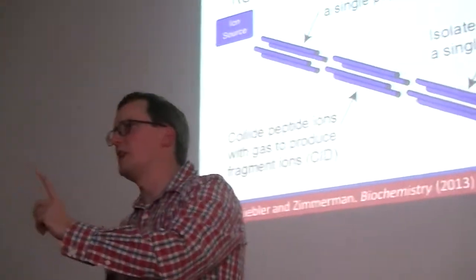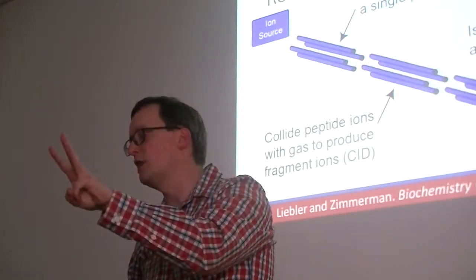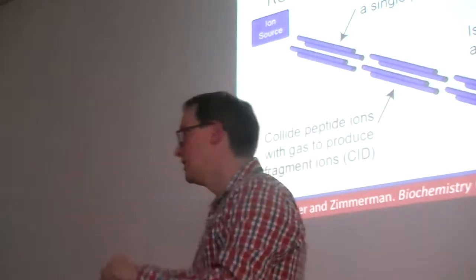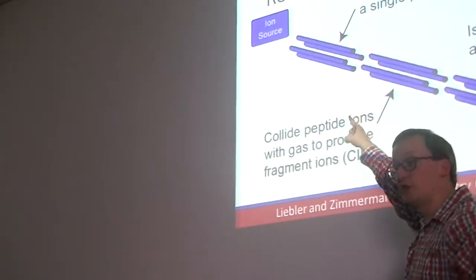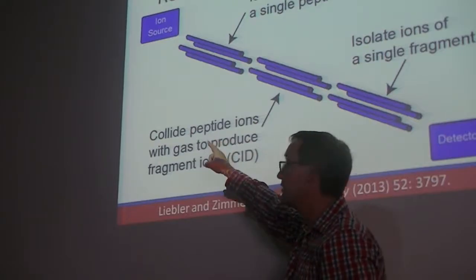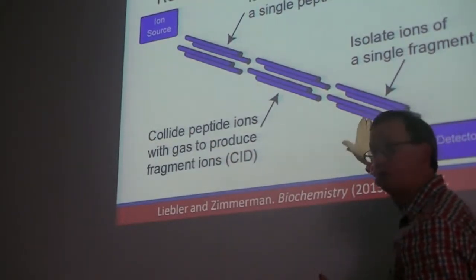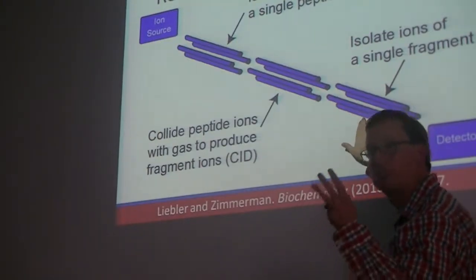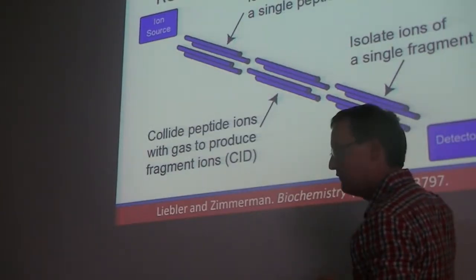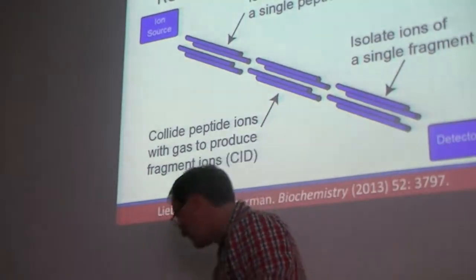This morning I said we wanted to keep track of 50 proteins, 3 peptides for each, 3 transitions, 3 fragment ions for each peptide. So this first Q1 is going to be rotating through 150 different peptide m over z values. Within each peptide m over z value, we're going to rotate through 3 different transitions, 3 different fragment ions that we expect for that peptide. In effect, we get 450 different transitions measured as chromatograms.